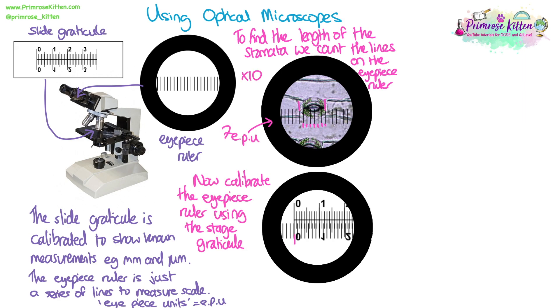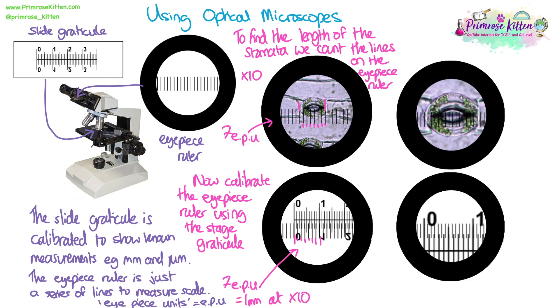Now I'll have taken away the microscope slide with the leaf tissue, replaced it with the graticule slide, and laid the eyepiece ruler so they line up in a straight line over the ruler on the slide graticule. I now need to see how many eyepiece units is equivalent to a known length on the slide graticule. Here we can see that my seven eyepiece units is the equivalent of one millimetre.